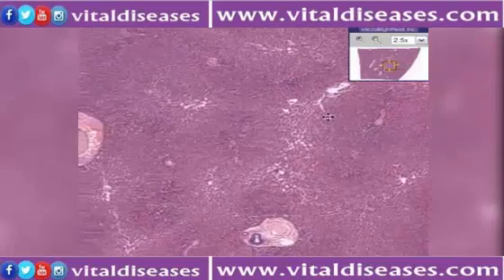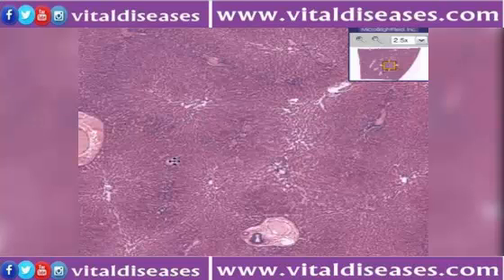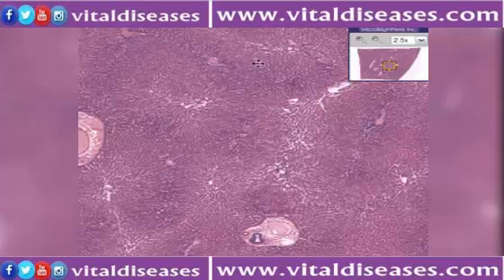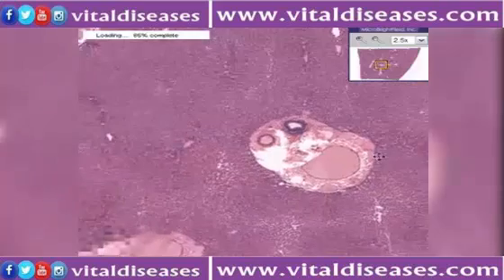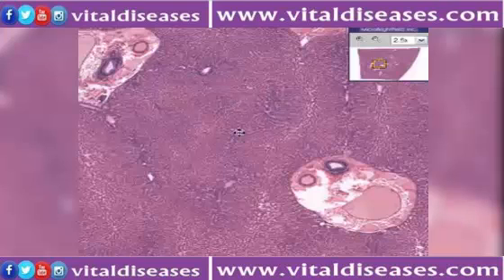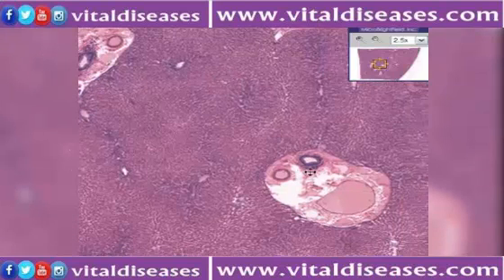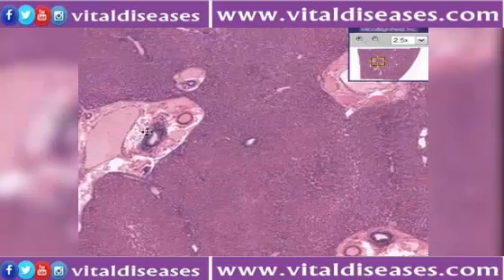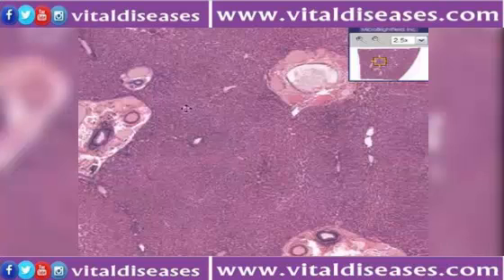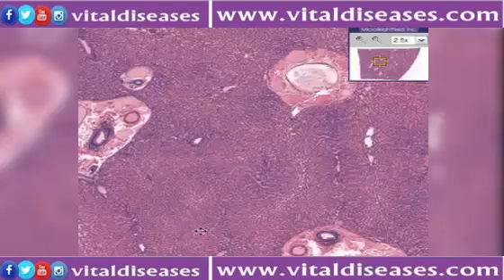In addition, notice the lobules of the liver. There's a lobule, there's a lobule, there's a lobule. You can actually see lobules on the liver if you look very closely at the gross specimen. They're hard to delineate because they don't have any connective tissue separating them. The only connective tissue that you see in a liver is in a portal area, or perhaps as part of a blood vessel somewhere. Otherwise, the vast majority of the liver is lobules in which there is no connective tissue.